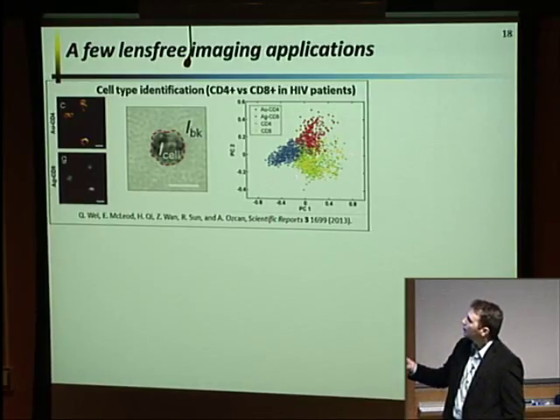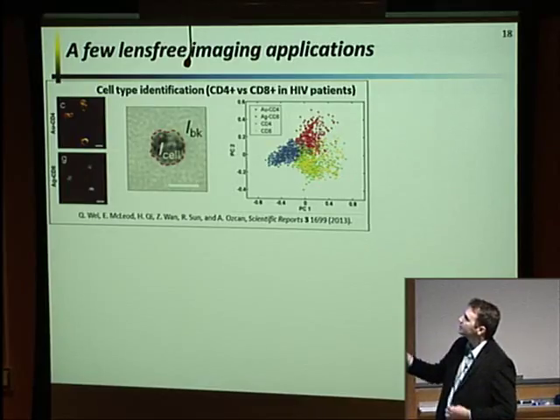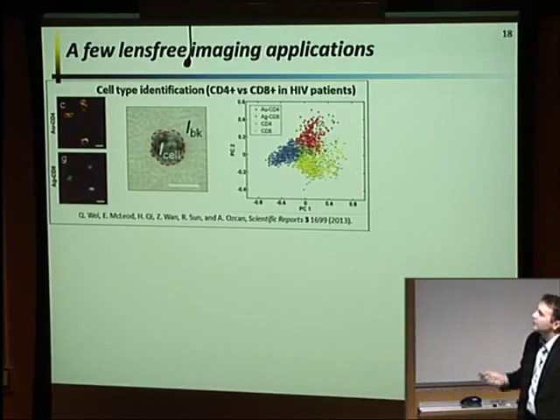And what you can go from is unlabeled particles we essentially can't discern, to the two different types of particles we can now separate in terms of our computational reconstruction, and we can tell the difference between these different types of particles.